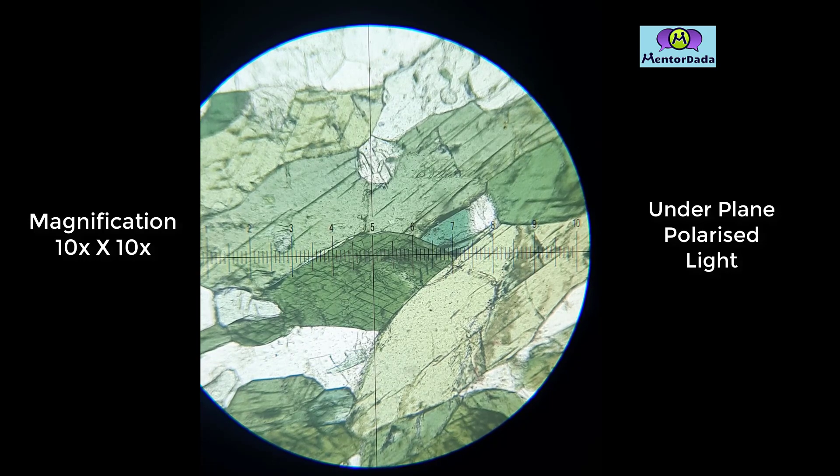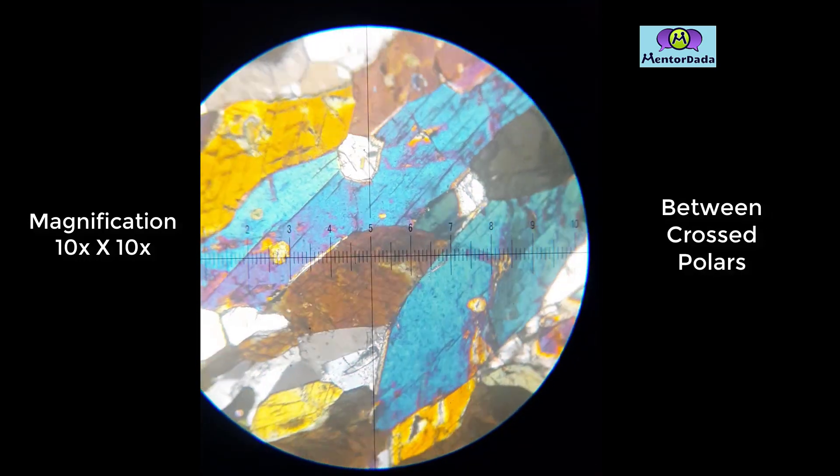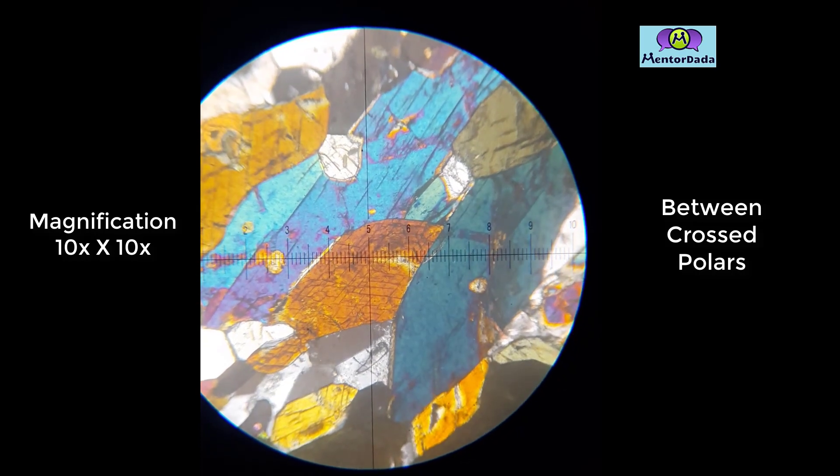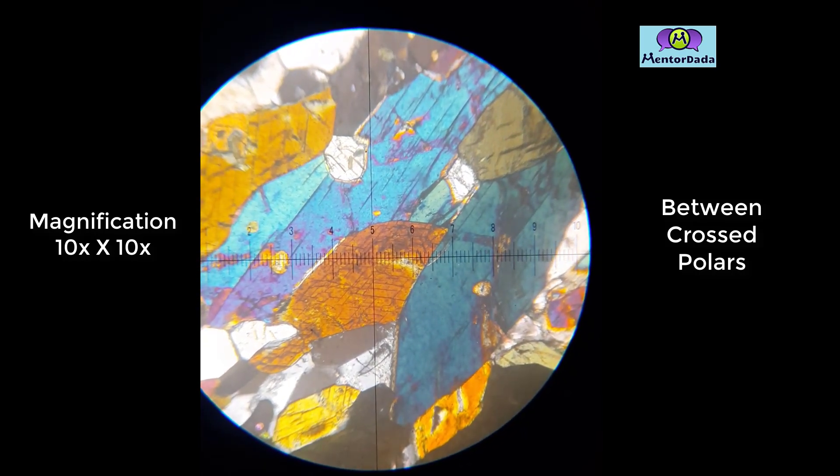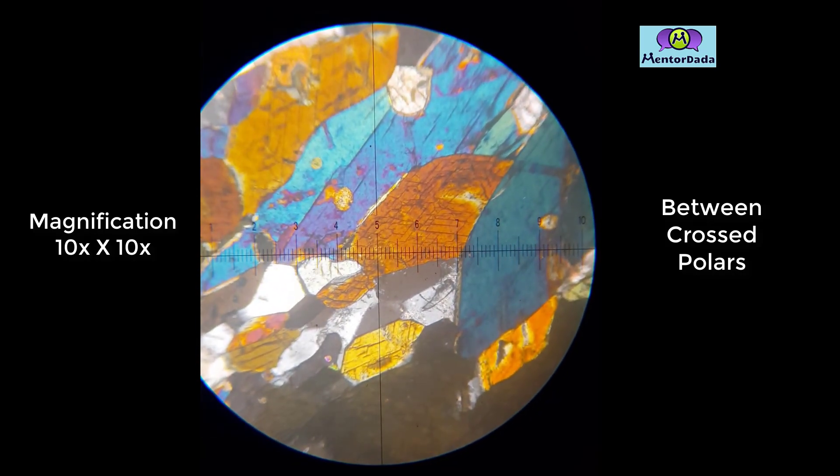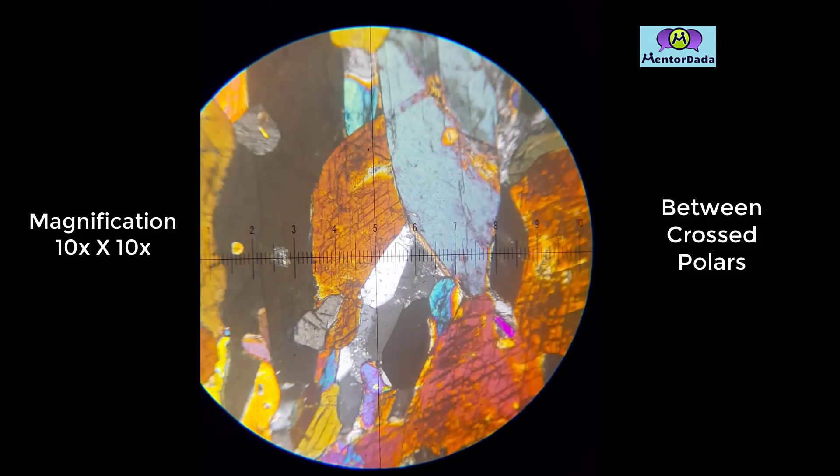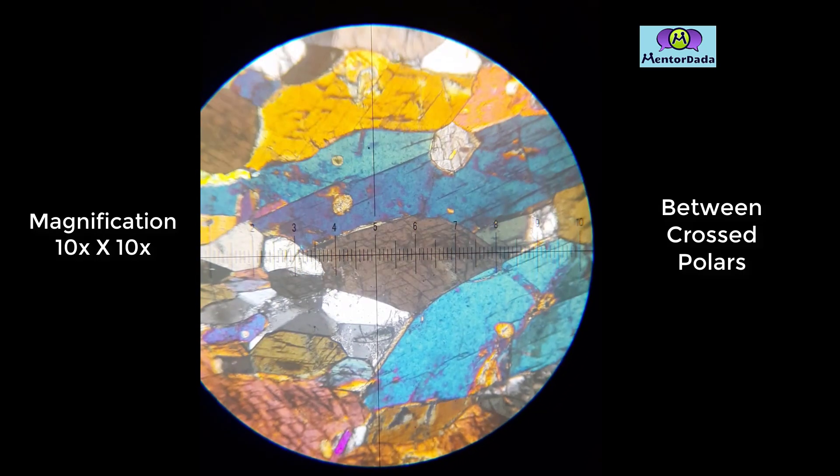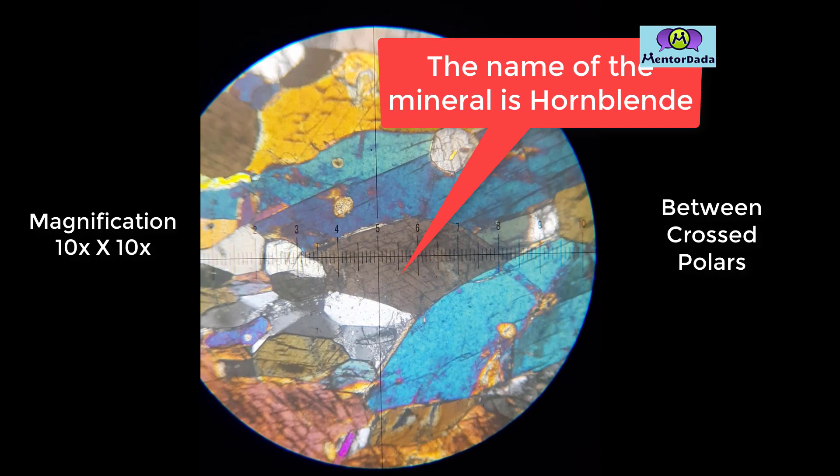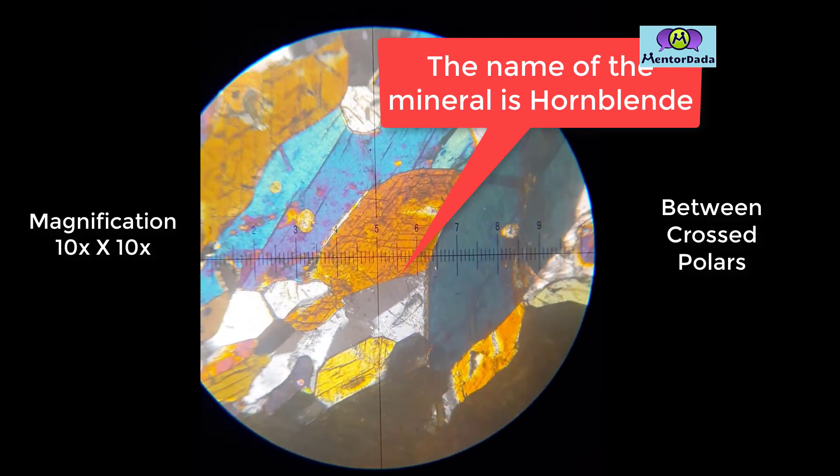No alterations are in the grain. Fractures are present. Twinning is not found. The name of the mineral is hornblende.